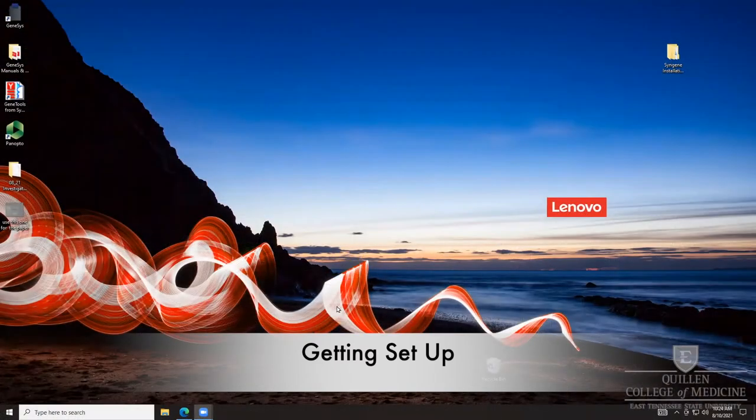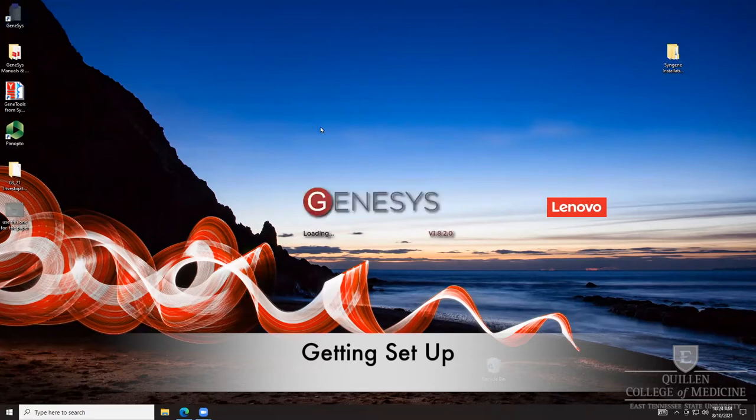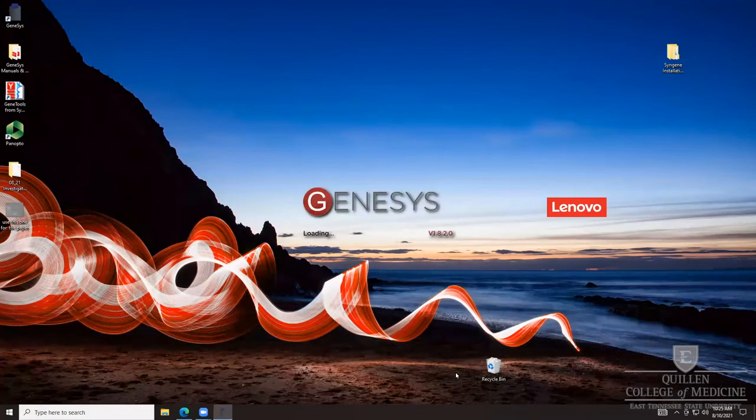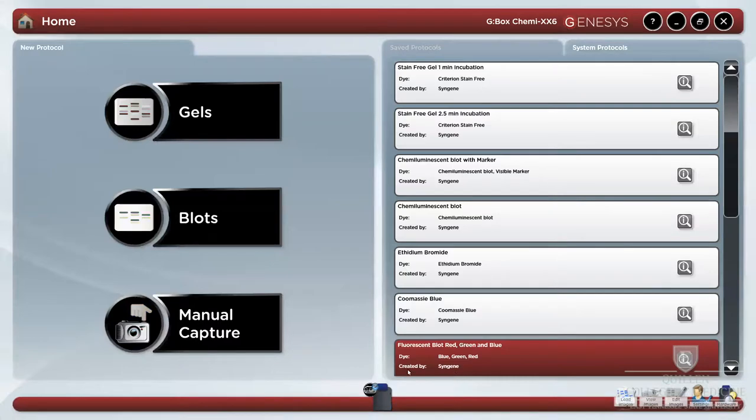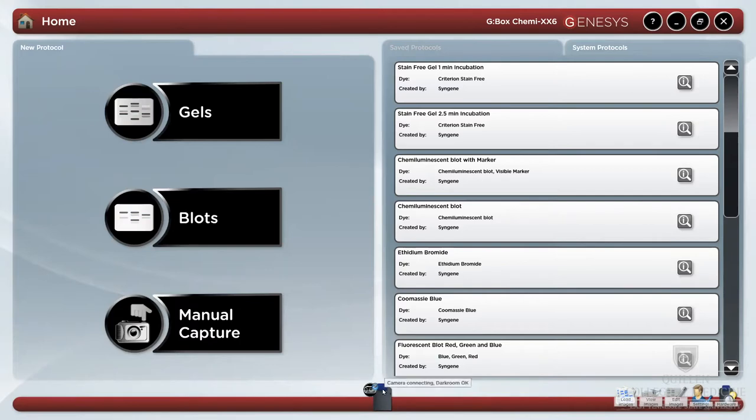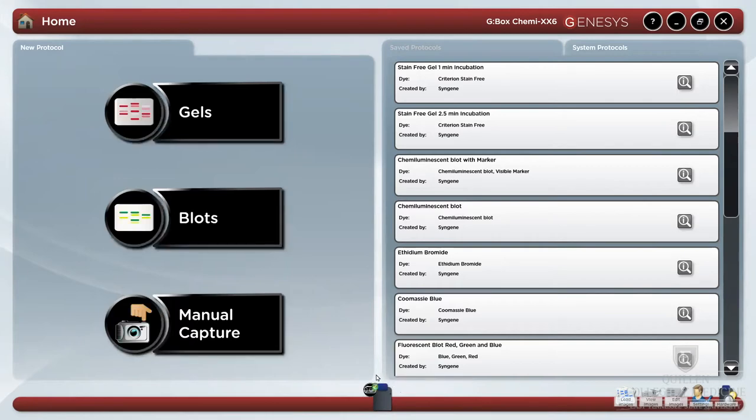To access the GeneSys software, select the icon to the upper left of the computer screen. The status of the digital darkroom can be found to the bottom of the screen. Hovering over the digital darkroom icon allows you to see details of the status. A green check mark indicates that the darkroom is ready for use.